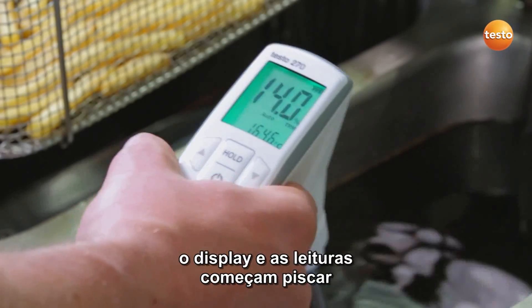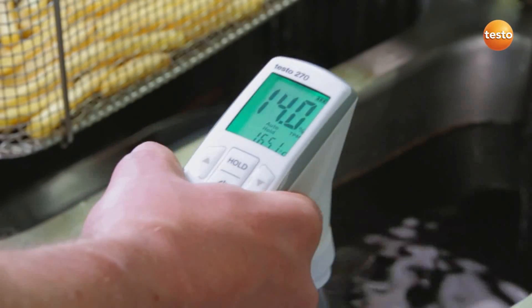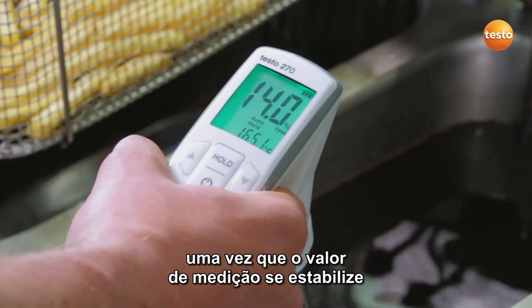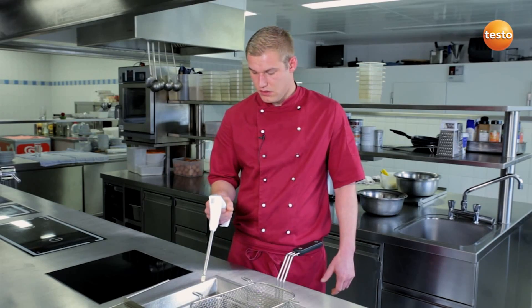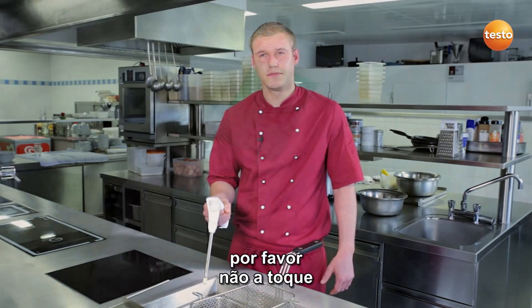In auto-hold mode, the display with the readings starts to flash. As soon as the measurement value is stable, the display freezes. That's it. Careful — the probe is very hot. Please don't touch it.